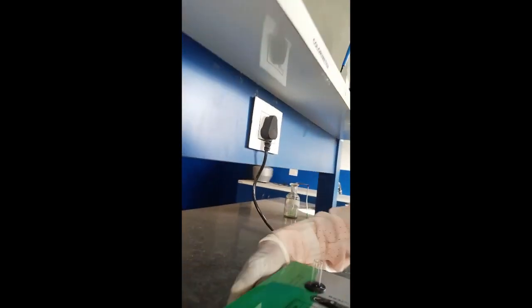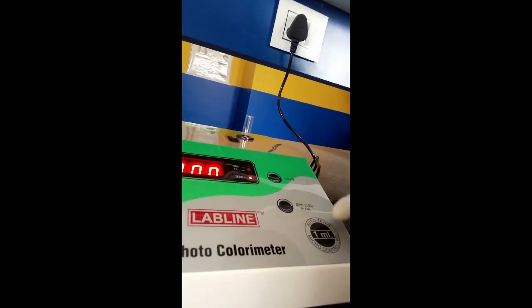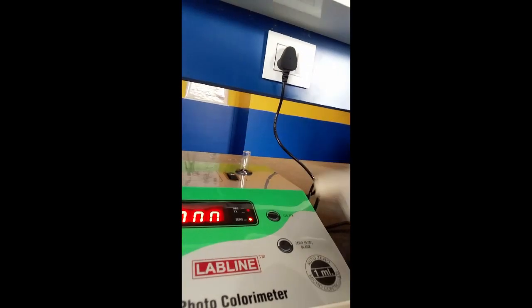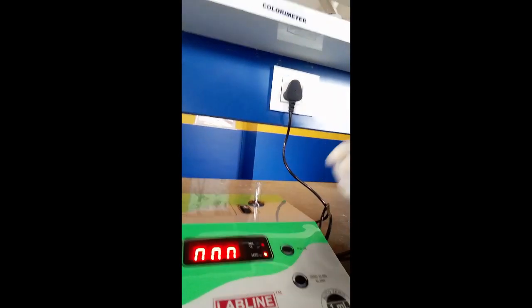Then we have one switch here. We have this switch here. Okay. After that, you can see there are two buttons given. So it is the auto 0 button. You put the distilled water here and then press 0, so that the result will be blank, and when you put the color solution, the result will change, so that you will note it down.